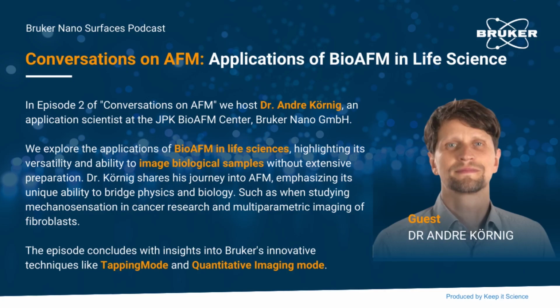So you also spoke about mechanosensation, and I'm really into biophysics and obviously mechanical systems. I was reading a lot in preparation for the podcast, and for me the most interesting study was mentioned in one of the recent ebooks by Bruker, JPK, about multiparametric imaging of fibroblasts. Fibroblasts are one of my favorite cells. So I would love if you can tell us a little bit about what the study is looking at in fibroblasts with AFM, and what is multiparametric imaging in the context of that?